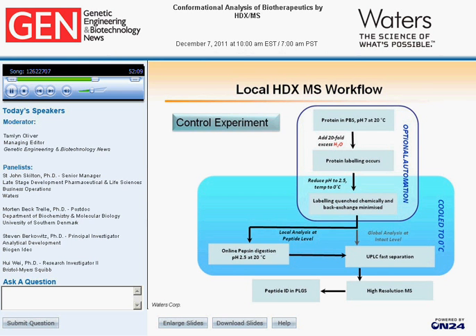In order to obtain a localized comparison between the pegylated and non-pegylated GCSF in the HDX level along the entire sequence, it is important to identify common peptides that can be produced from both proteins in each experiment. For this purpose, 3 control experiments were performed on each protein to obtain the common peptides. In the control experiments, H2O instead of D2O was used for the labeling step to facilitate the peptide identification. Next slide.